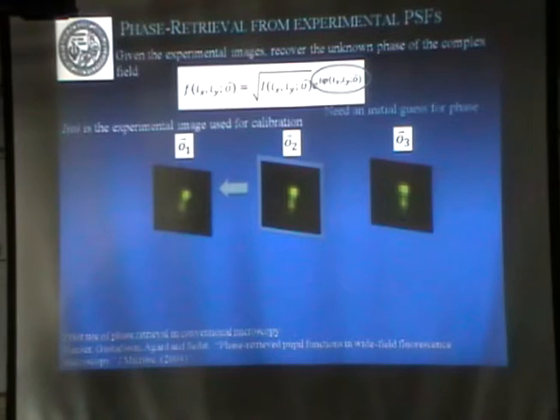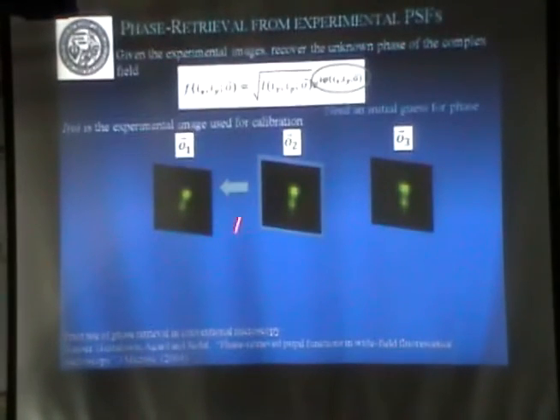It's doable, but another way of doing things is to measure the pattern in a few places and then interpolate. Now, the way to interpolate is not splines or anything like that, because you know that this is a wave. So in order to go from here to here, you have the equation we saw yesterday, the Fresnel diffraction. So you can propagate these things and find the intermediate place.